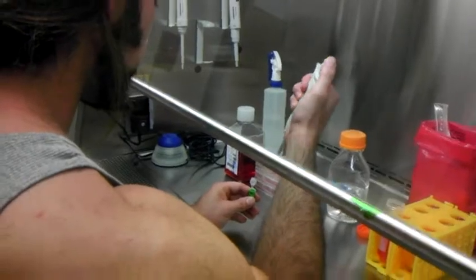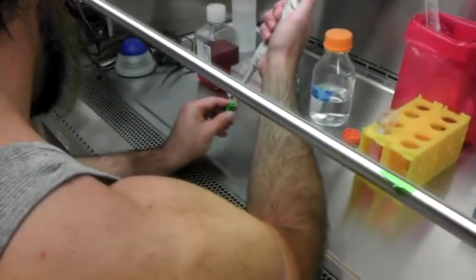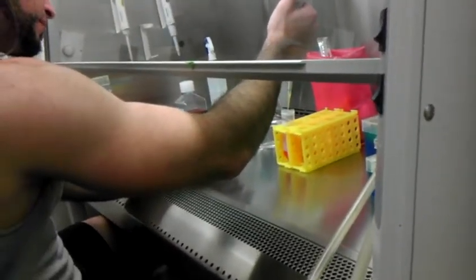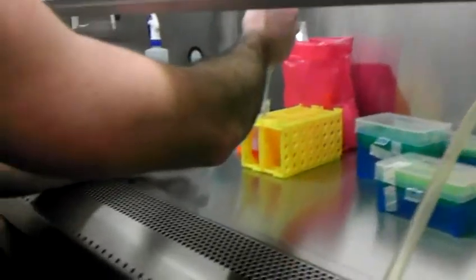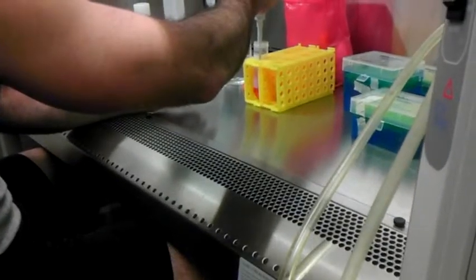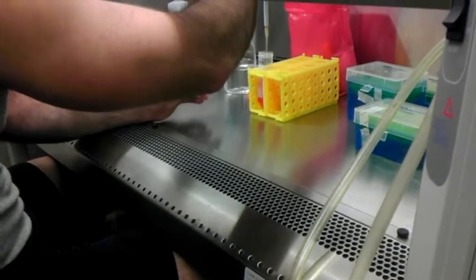It's all good. So grab 20.8 in there. Yep, got it. Then put it directly into the media. Put your tip into the media and inject it. Don't put the whole thing in there though. Inject it all the way. Pull out. Inject it all the way again. Now pull the air. Now let go of the button.